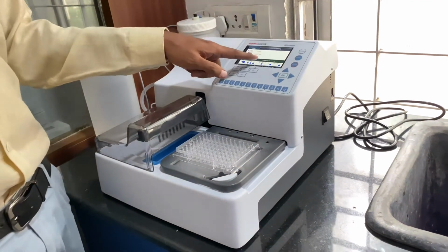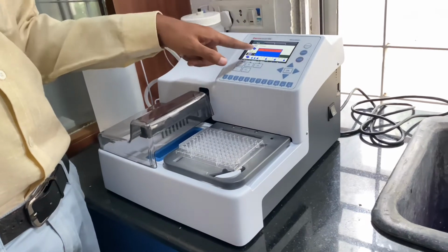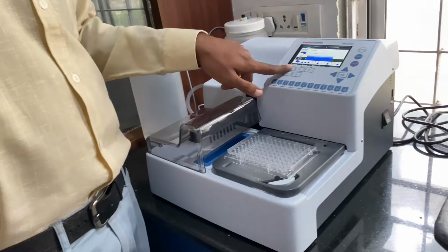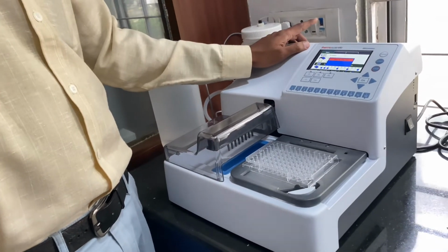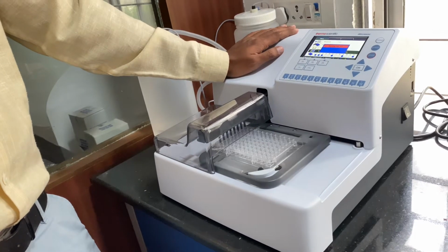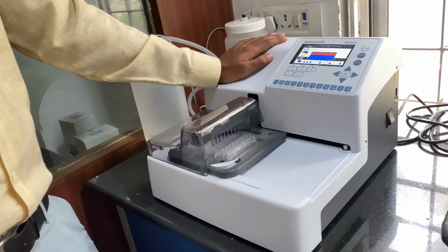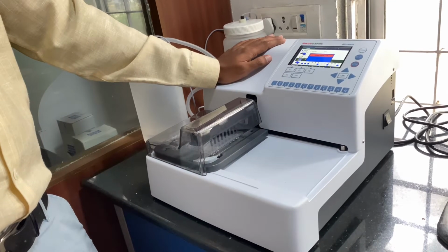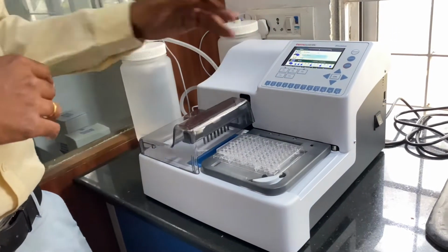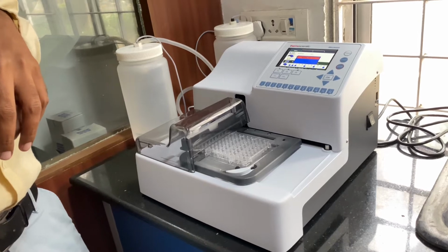Okay, priming is done. Now we will start the flow. So we did priming, then you press start. Wherever we define, only there it has been. That number indicates the complete row.